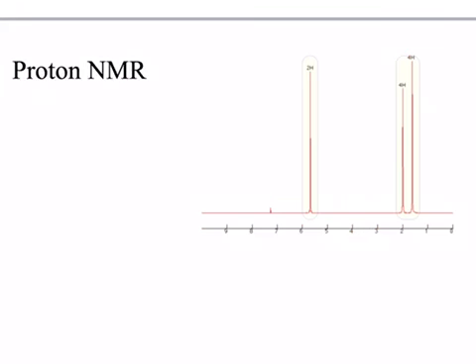After looking at MS and IR spectrometry, we came up with the formula C6H10 with a DOU of 2, indicating the presence of a pi bond and a ring, with a possible double bond between carbon and carbon with sp2 hybridization, and then carbon-hydrogen bonds with sp3 hybridization.